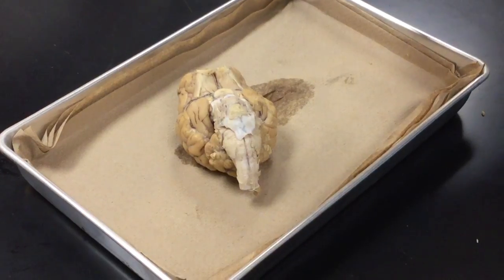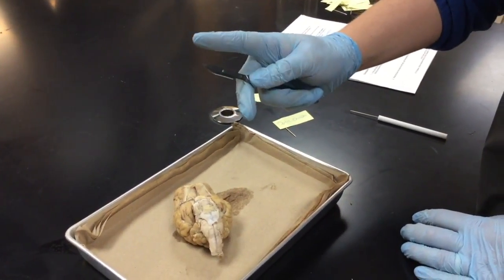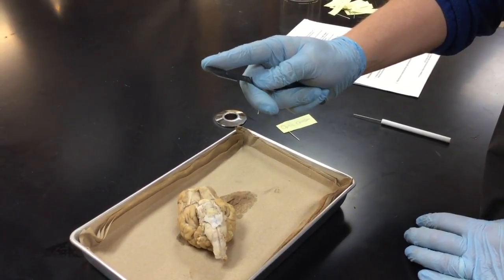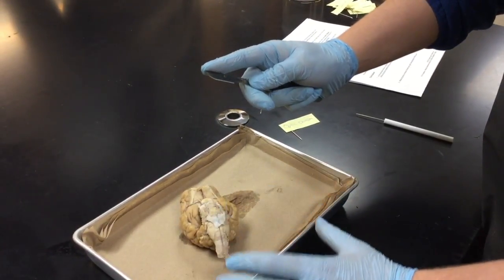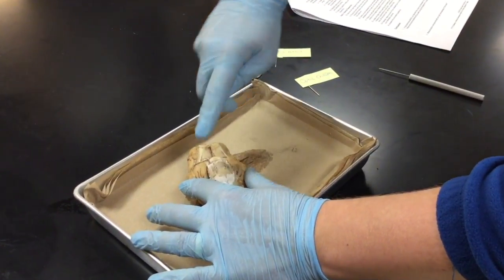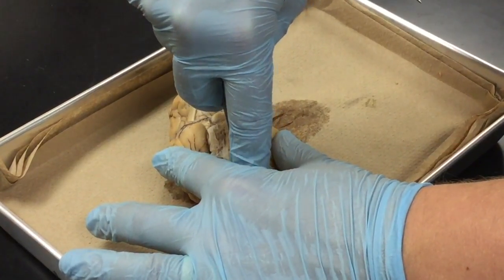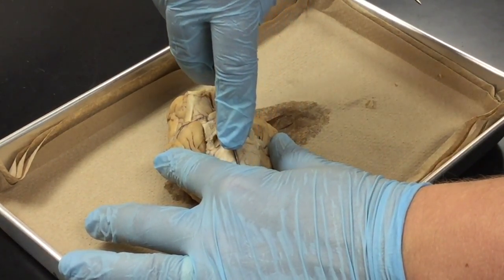Remember how to hold your scalpel. You want to hold it and resting in the palm of your hand, taking your pointer finger, putting it over the dull end of the blade, holding the specimen with your other hand, and cutting away from your body. You're going to start at one end of the brain stem and you're going to cut right down the middle.